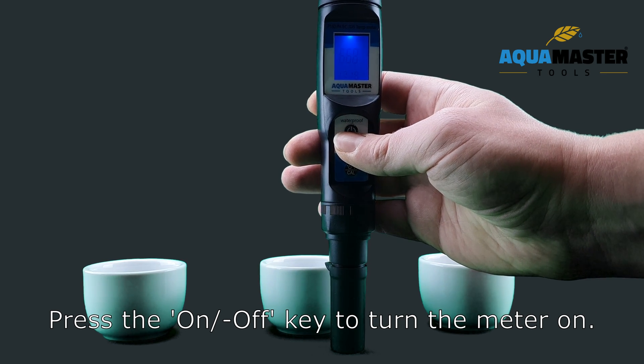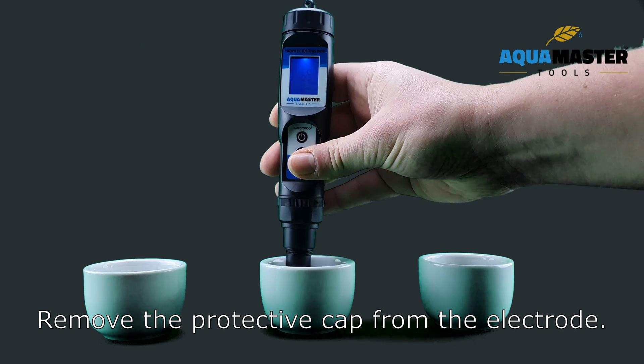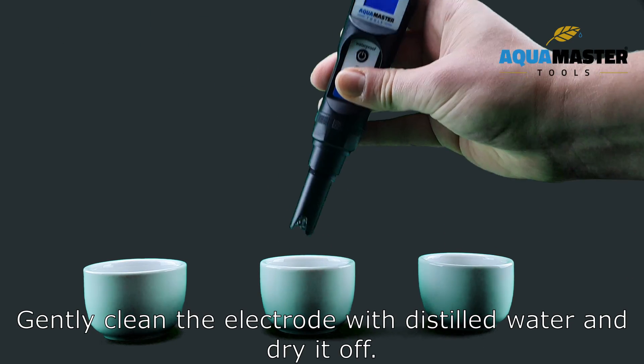Press the ON-OFF key to turn the meter on. Remove the protective cap from the electrode. Gently clean the electrode with distilled water and dry it off.